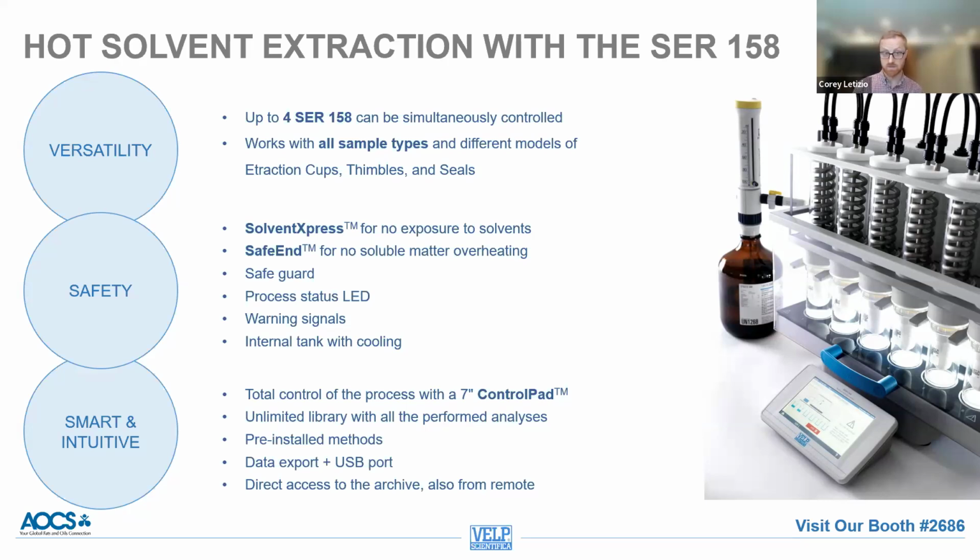What's really nice about this system is our Solvent Express technology. So with this system and for lab operator safety, you're not going to have to touch any solvent individually. You can put it directly into the system without ever actually having a lab tech touch the solvent. So that's really good. Another thing about safety is going to be that safe end technology. So once the analysis is complete, the cups will actually raise up from the heating block, and that way there's no burning of the sample or anything of that nature. There are different warning signals, safeguards, things of that nature, as well as an internal tank with cooling so the system never overheats.